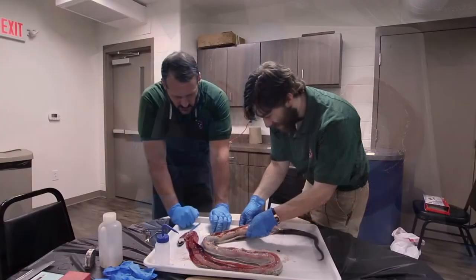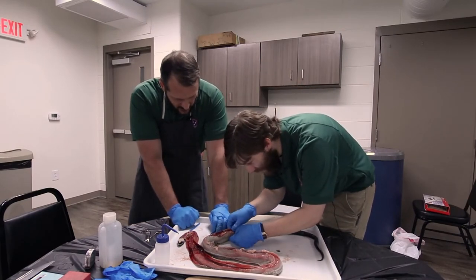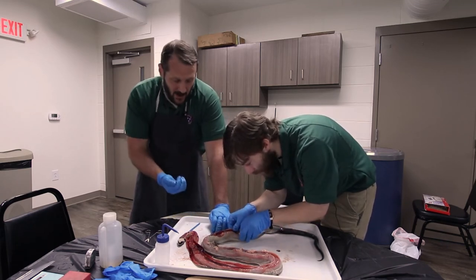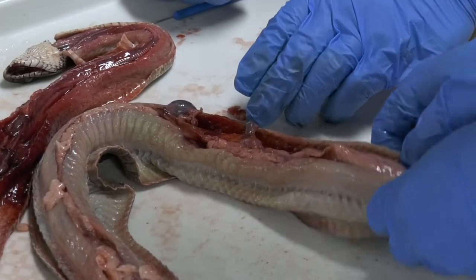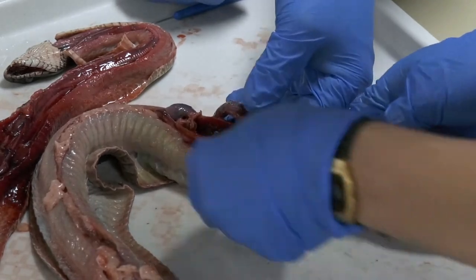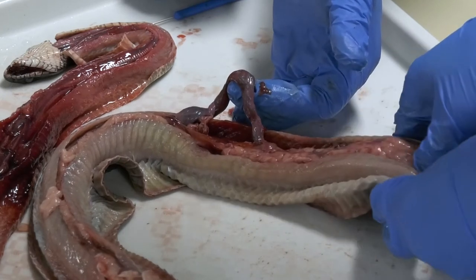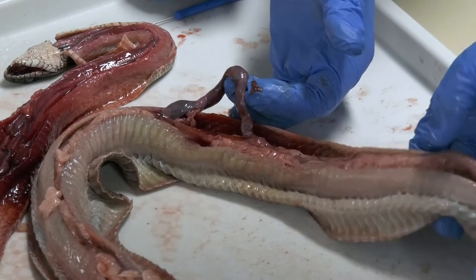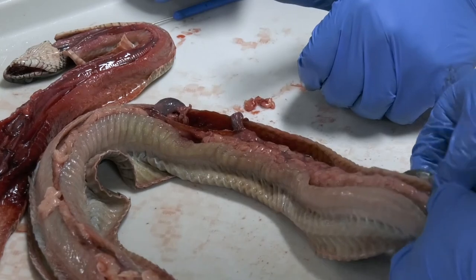A gallbladder is an interesting organ. Not all vertebrates have it. When it is found, it's found associated with the liver, close by. In mammals that have a gallbladder, it's actually tucked between two lobes of the liver. But this is an especially important organ for carnivorous animals, because while the bile that the liver creates is used in the digestion of fats, the liver produces that in small but steady quantities.